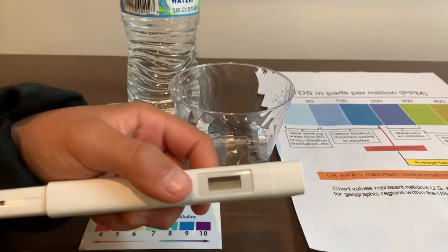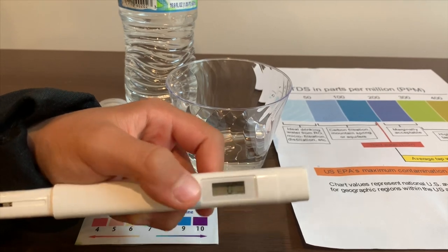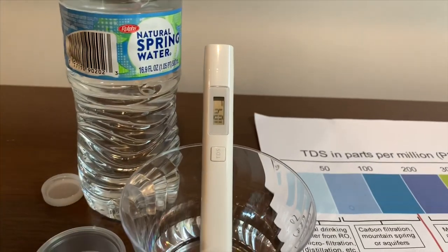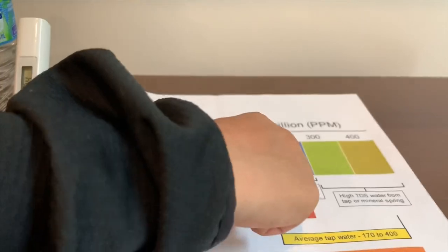If you want to buy this TDS tester, check the link down below. Turn on the TDS tester, make sure it says 0, and put it in. 104 — that is okay to drink.